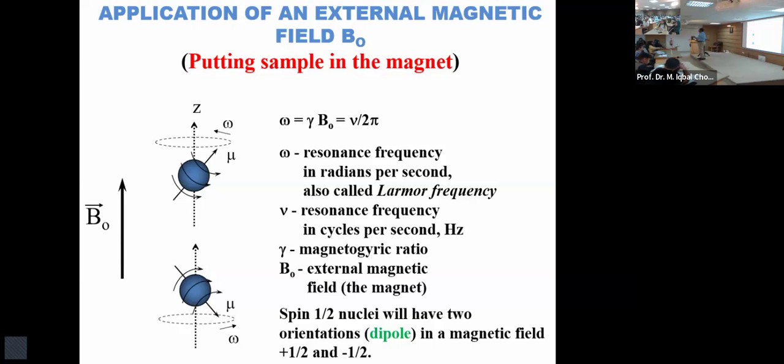And that is the reason that NMR is so powerful, that now there are probes available which can detect a number of other nuclei. They are general probes. Probes are a small cylinder which detect the signals coming out of the nuclear species which you are trying to detect.